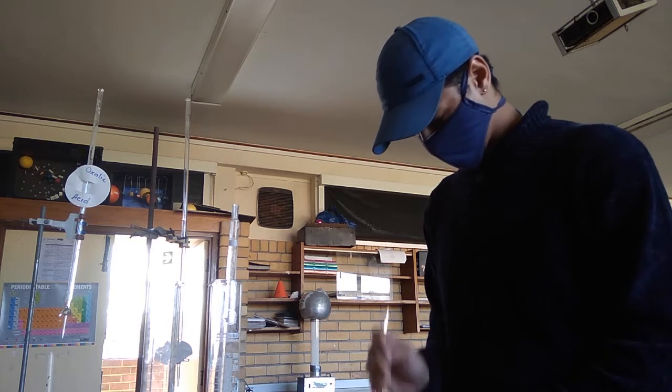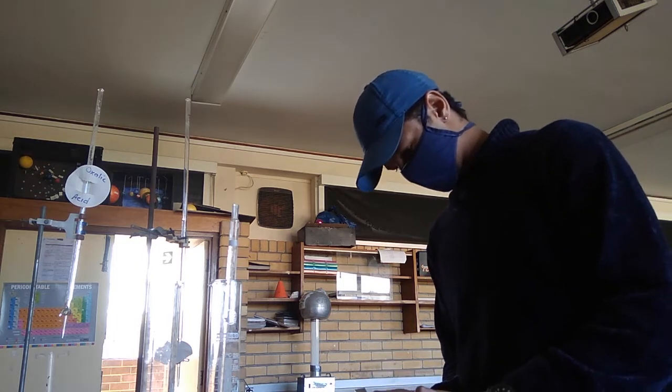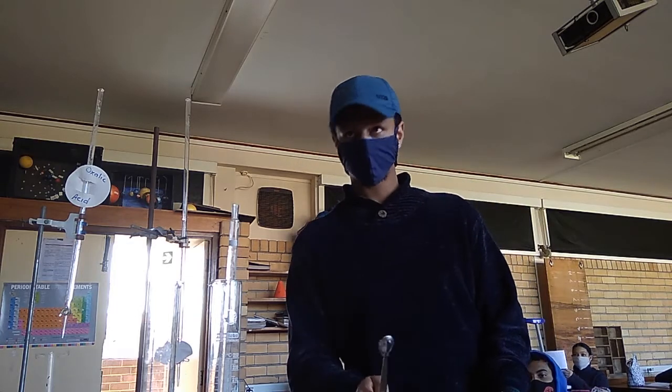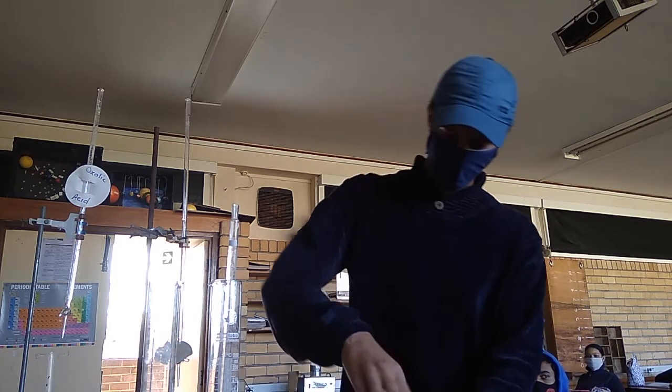Do you see that we're not measuring anything? This is our unknown or non-standard solution of sodium hydroxide. Great. So he threw in a heaped teaspoon and you can stir it. Thanks. And you can close that. And just hold it for the class to see.